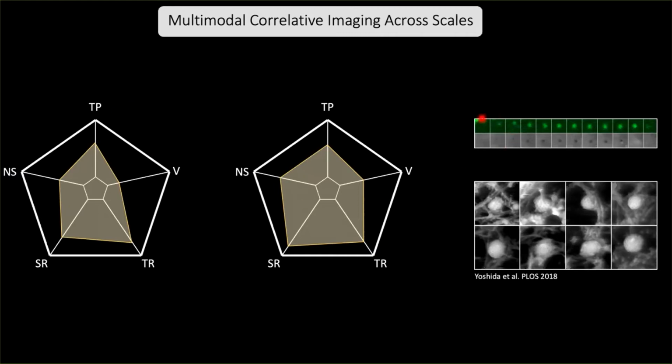And the nice thing is that one can image even live, so you can in parallel acquire the fluorescence and the AFM information, albeit it's two-dimensional, as in TIRF microscopy. If one wants better resolution to really harness the high resolution of the AFM, the sample has to be fixed, so the temporal resolution is gone, and then the resolution is actually quite nice.